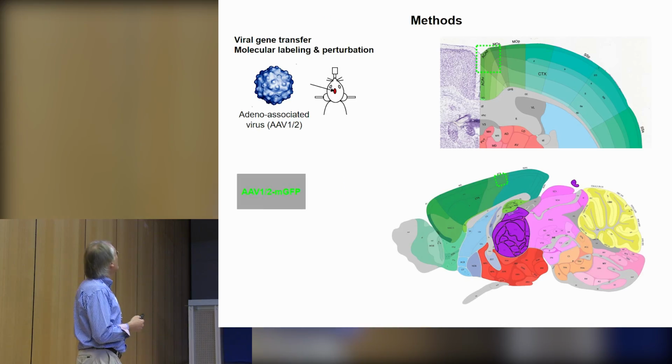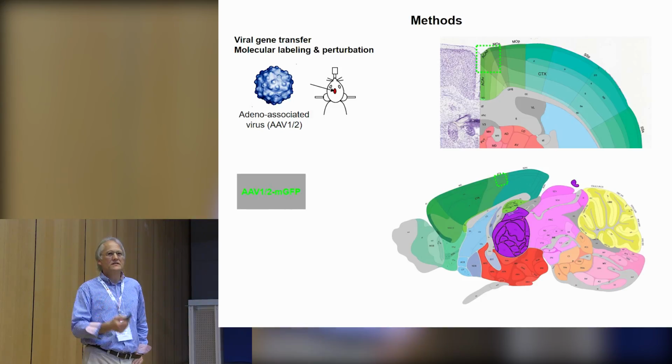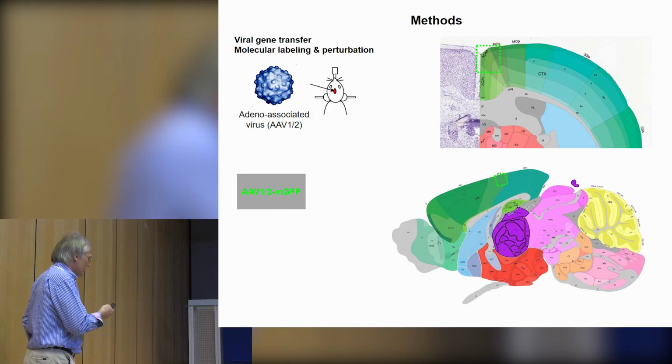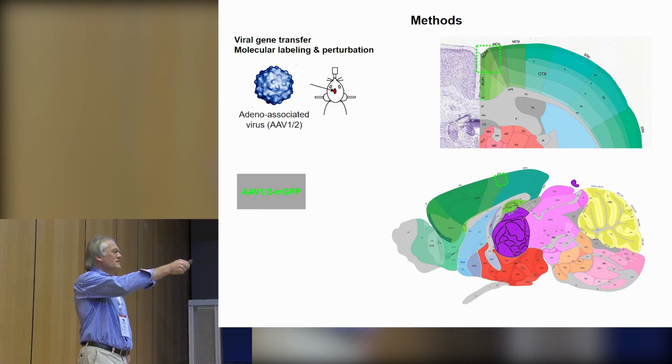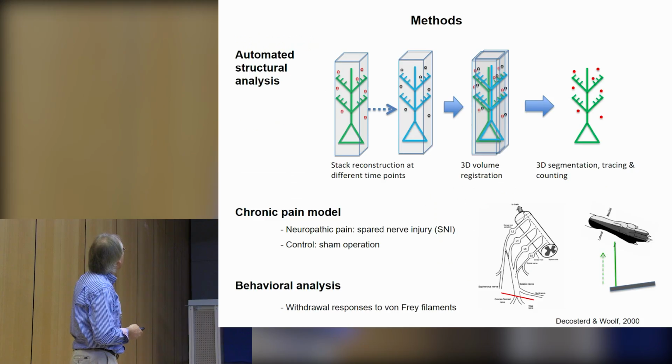So the way we do this is we again use viral gene transfer into this area here of the cingulate cortex. And in some cases, actually, in the meantime, in all cases, we also inject the thalamus down here to have also presynaptic inputs. And we're actually looking not only at the plasticity of the dendritic tree, but we also study plasticity of presynaptic inputs, so we can do both at the same time. But I'm not going to go further into this. But this is what you saw very initially when I explained two-photon microscopy. Remember the stack that was going into the brain? This was the situation with both pre- and postsynaptic elements labeled.